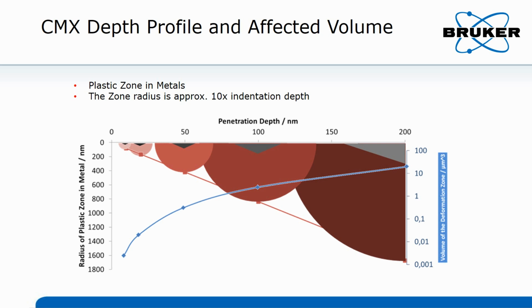If you imagine to have a thin film, then the thin film tested will be only a portion of this large deformed volume, and therefore with the smooth transition that we have for hardness and modulus measures from the thin film properties to the substrate, it is not easy to determine the film thickness.